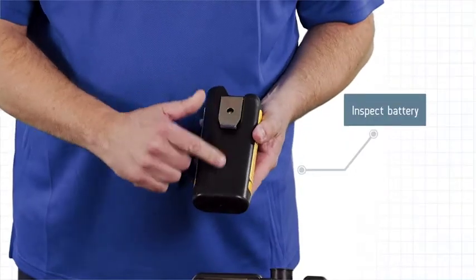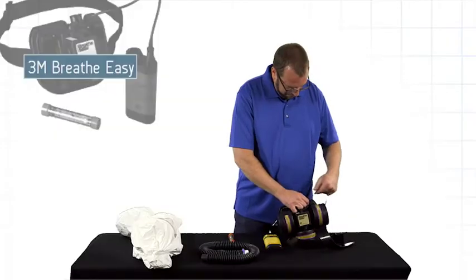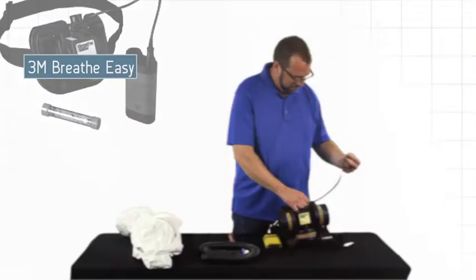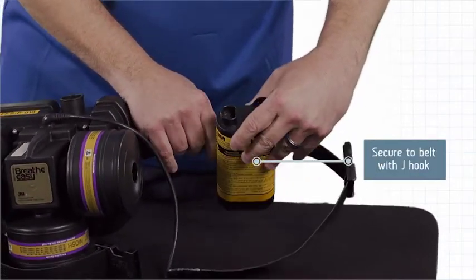Inspect the battery, looking for the service sticker and any damage. Inspect the power cord. Place the battery on the belt, making sure the J hook is latched.